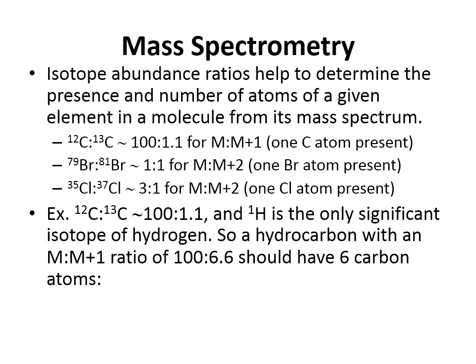Well, we take the 6.6% and we multiply it times the fact that there are, for one carbon-13 atom, 1.1% abundance. So 6.6% times one C13 atom per 1.1% abundance gives us 6 carbon-13 atoms, which is of course the same as saying that there are 6 carbon atoms present in the molecule.